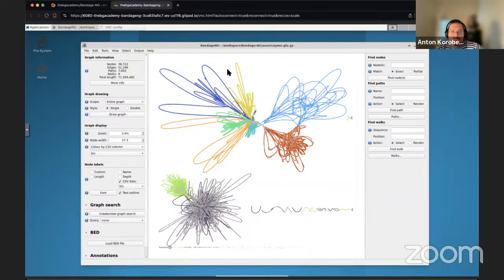Yeah, so you can see that there are multiple bins, and some of those bins look similar to the difference in the GC content, meaning that we're pretty good, but at least in the genome part we definitely see some mixed things. Let me just reduce some clutter.